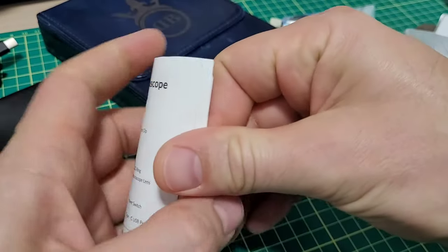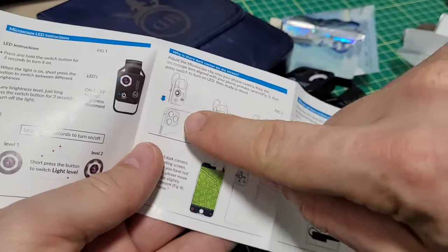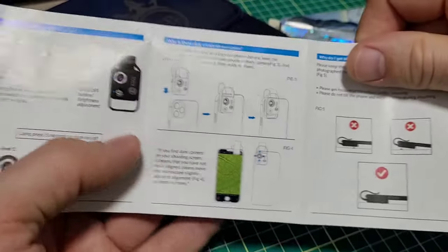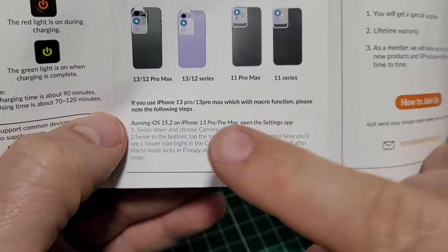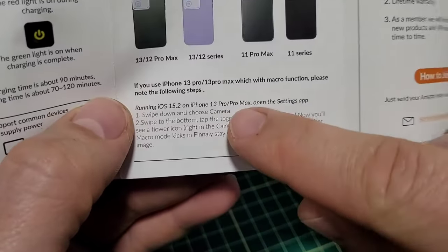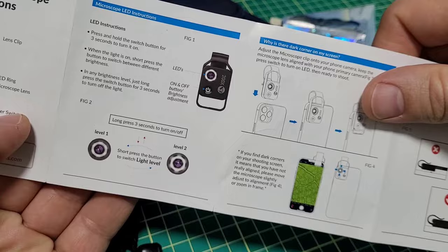It's pretty straightforward — you've got instructions in English and Chinese on the back. Essentially you just clip it on. On all the new phones you have a cluster of lenses; you need to use your main primary lens. It's a little sensitive — you've got to find it and move it back and forth and you'll see the image appear. A special note: I'm not an iPhone person, but for the 13 Pro Max folks there's a setting you need to change — they give you instructions on what you need to do. You just plug it in to charge through the USB, and there's a little light on here too.